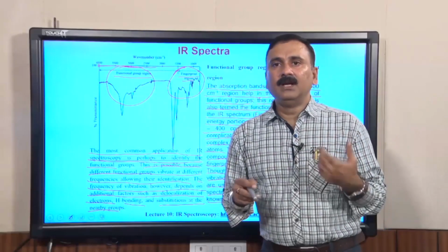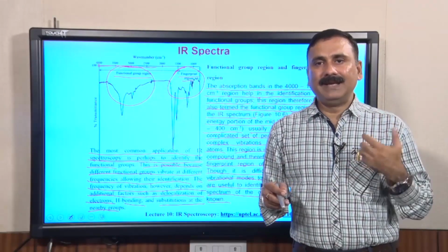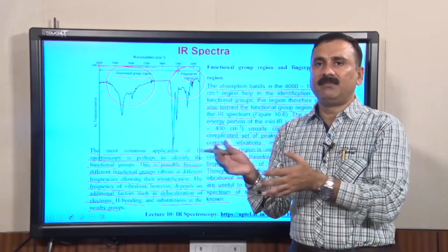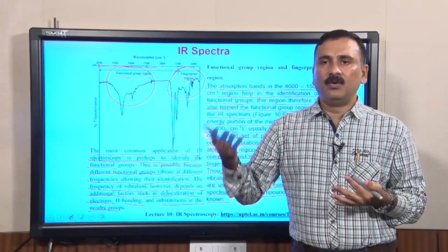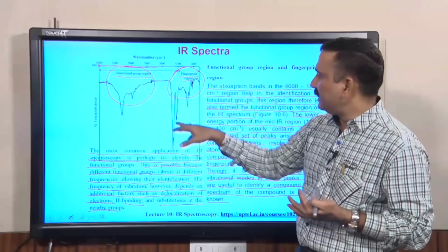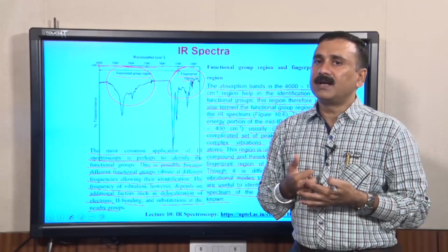So, as I said, not a single technique is complete on its own, and that is why it is important that you use multiple techniques. If you have the already known IR spectra of a particular molecule, then you can assign these peaks and characterize the compound.